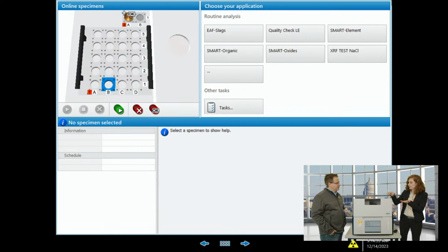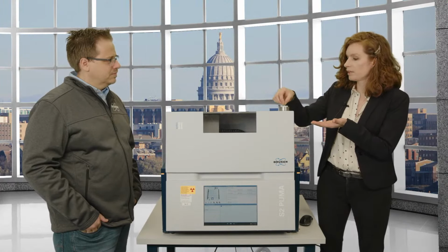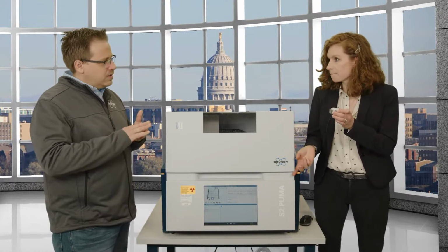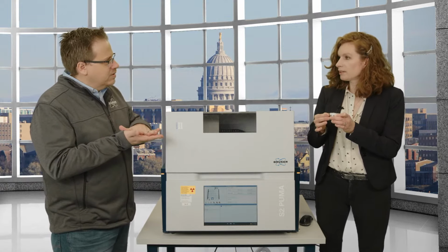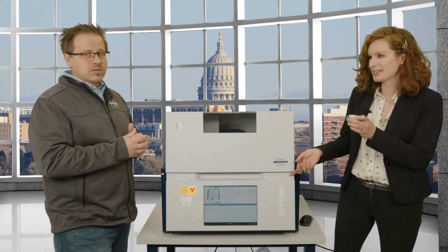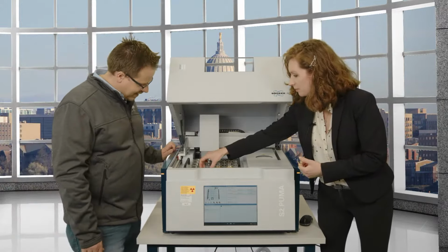I'm going to put everything into a little cup. We call it a liquid cup or a powder cup, but you can also put something like this in there. So you don't have to melt it down, grind it down, make it perfectly flat. I mean, you can, but you're not going to do this to this. No, you don't have to. Also, we would have a problem, John, if you would make me do that.